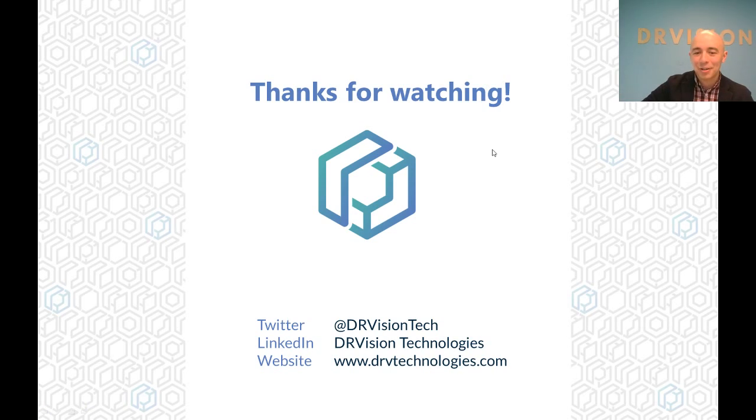All right. Thank you guys so much for tuning in. This has been a very basic introduction to some essential image analysis techniques. We started by looking at who we are as a company. We talked about cell counting as well as cell tracking, and we gave a quick demonstration on how those work in our software, Aivia. If you missed our last episode, it covers some of the basics of how to visualize images in Aivia. This will give you a solid foundation, so I recommend you check that out.